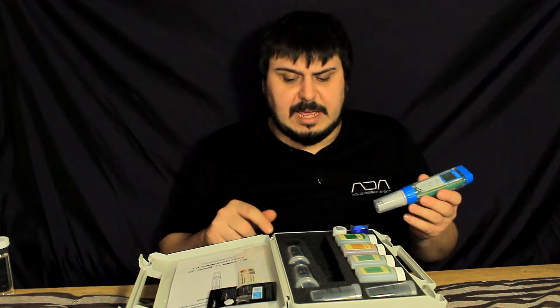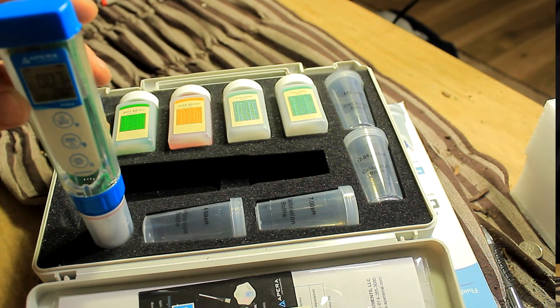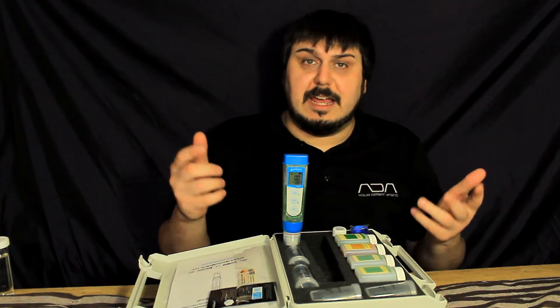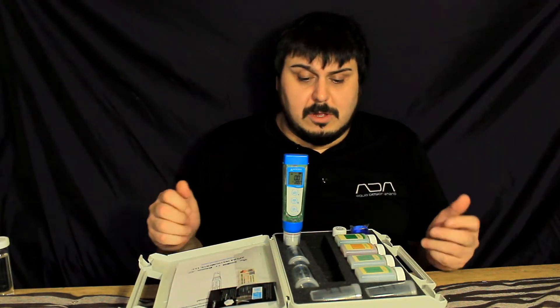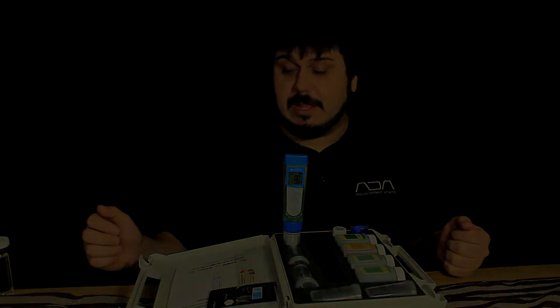Another cool thing they put on the case itself is a small hole to hold your pen so it's not going to fall over and you can get an accurate reading. Something really simple that they thought of, and I really appreciate that.